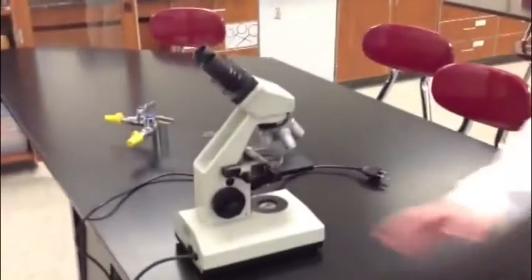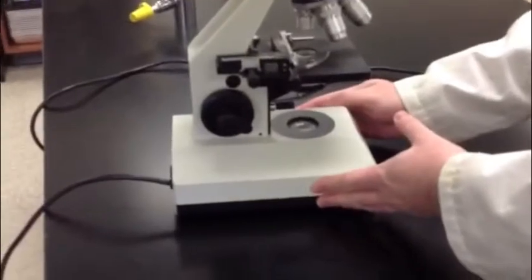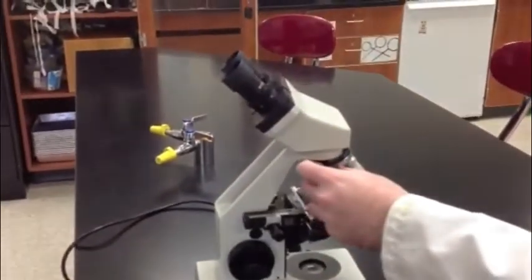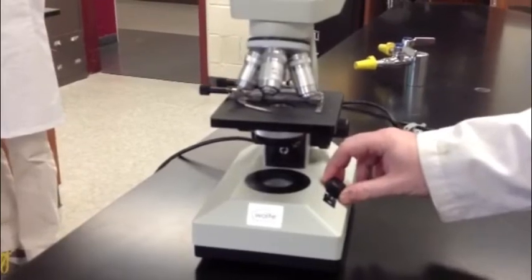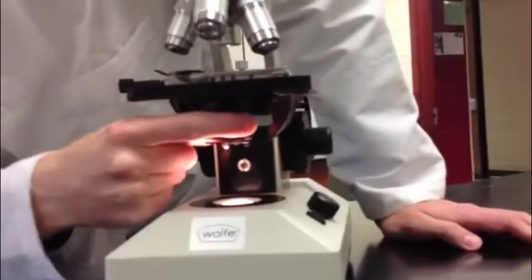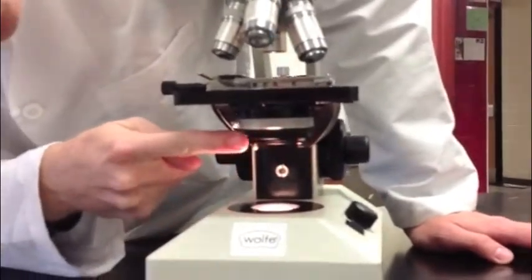So before we get into the ways not to use a microscope, let's introduce some of the parts of the microscope. As we mentioned before, as we were carrying it, this bottom part here is called the base, and it supports the entire microscope. This also is connected to the arm, which supports the eyepiece and the objective lenses. Other parts of the base include the light, light switch, which is right here, and the light adjuster knob, which regulates how much light power comes through the microscope. The light comes up from the bottom through this cylinder, which is called the condenser. You've also got the diaphragm here, which can adjust the amount of light hitting the specimen.